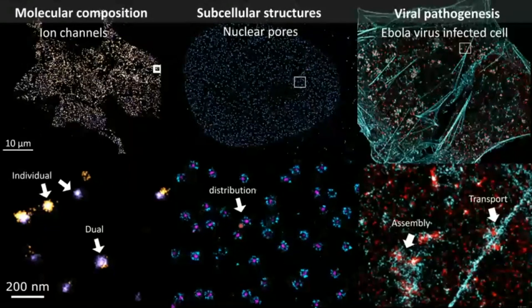We can also use super resolution to study viral pathogenesis or other small particles. Here we have an Ebola-infected cell, and we can look at these viruses during their assembly as well as during the transport and how they hijack the cellular machinery for their infection.